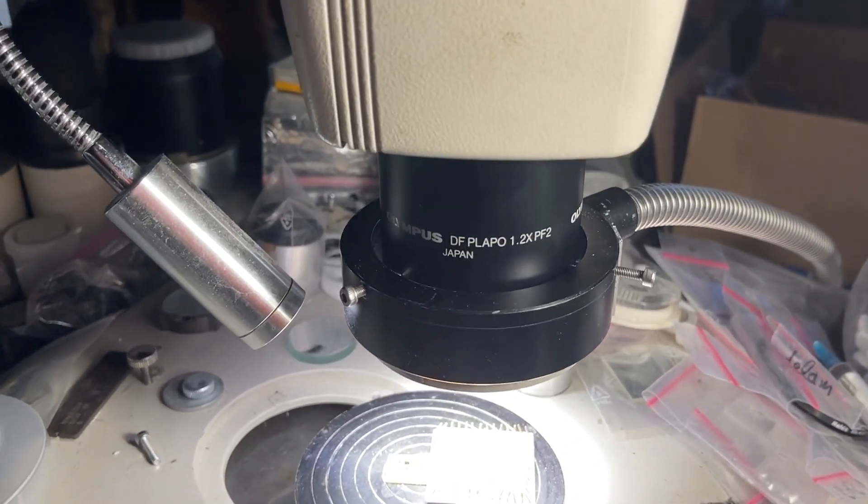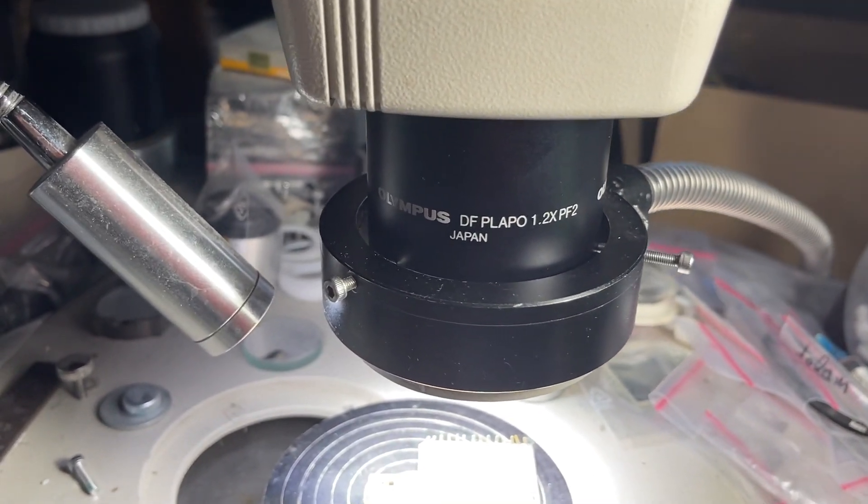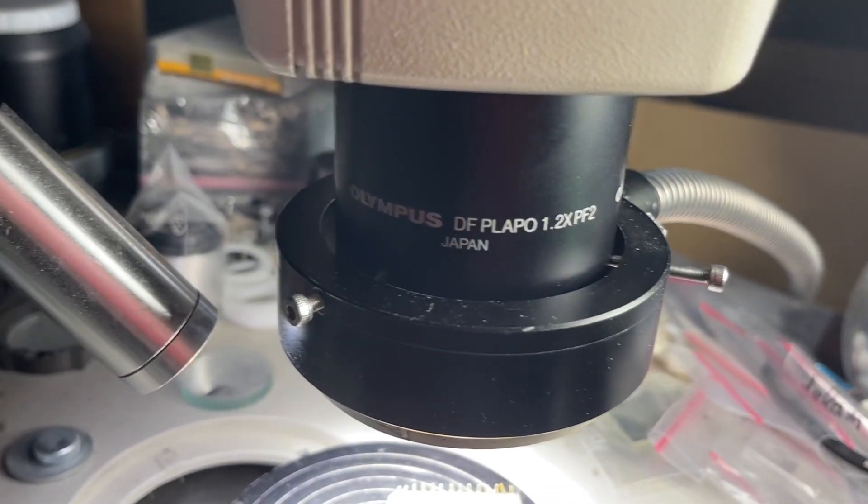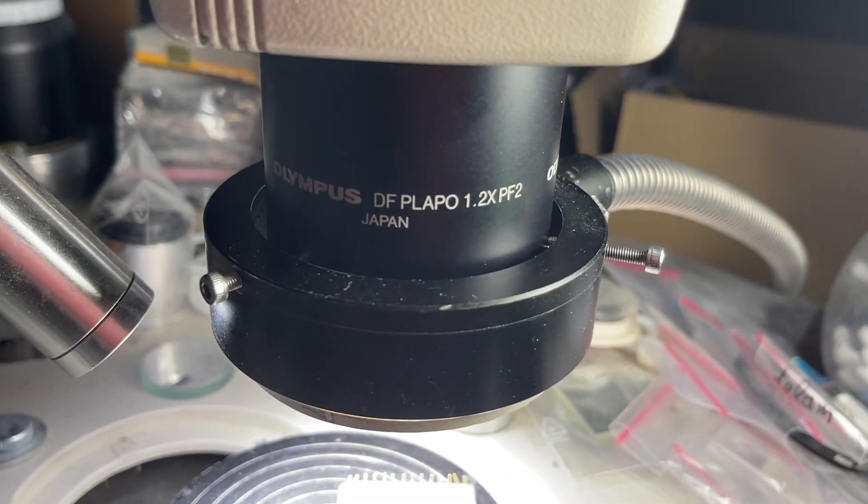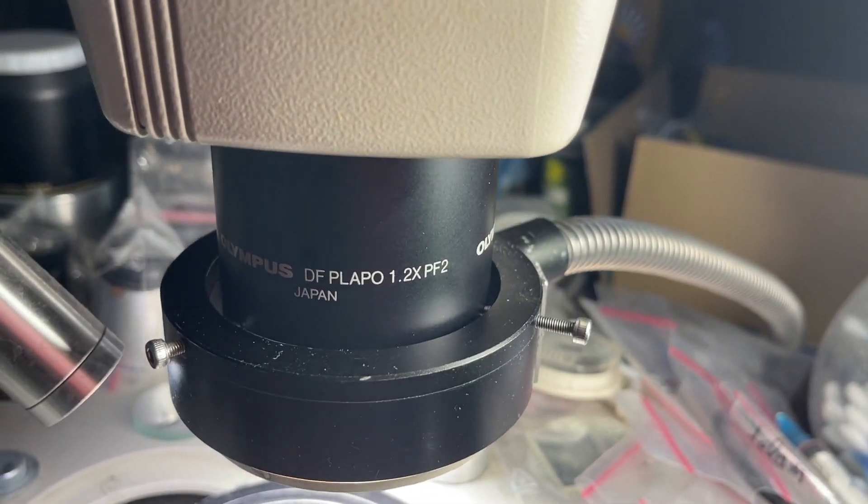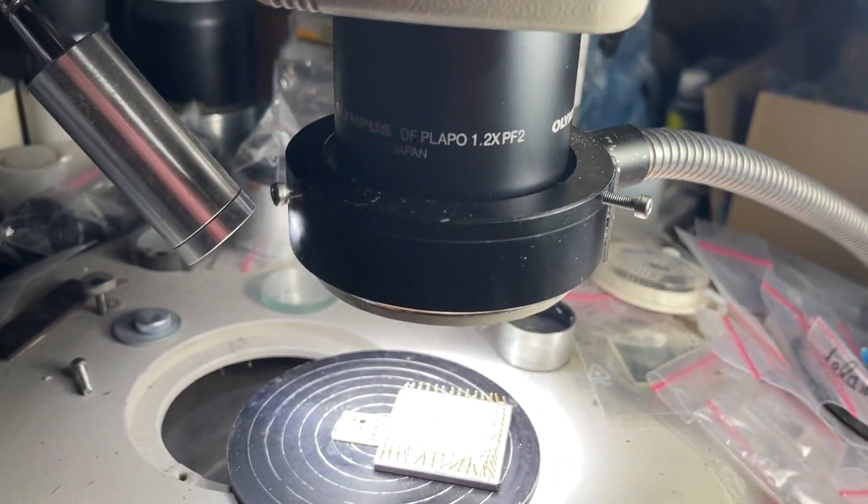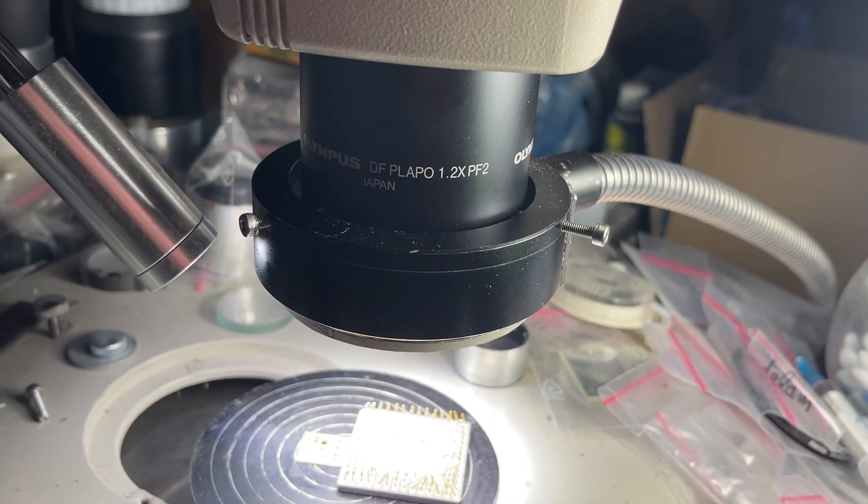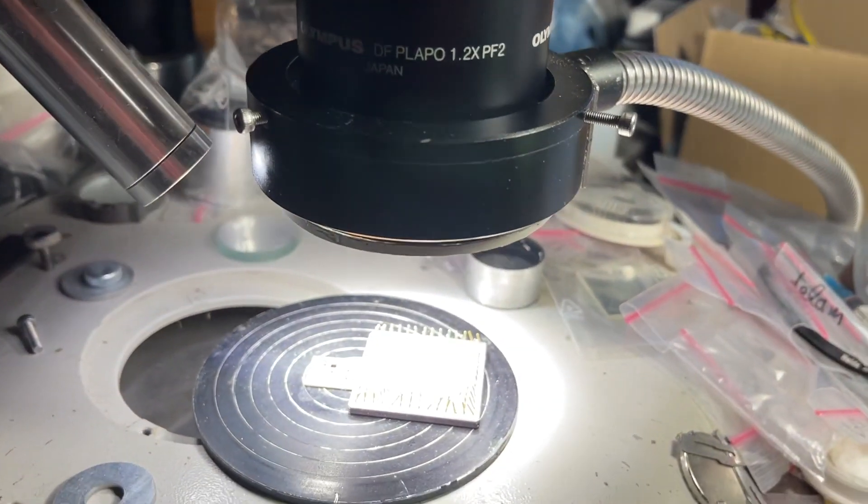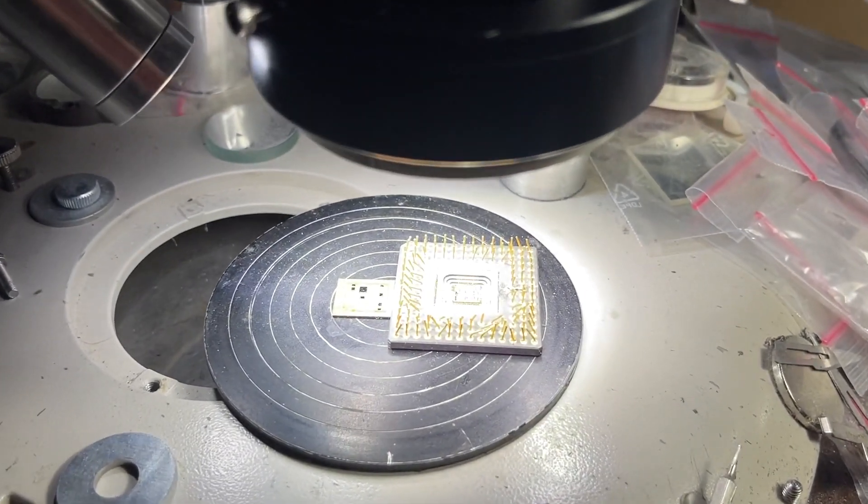Okay guys, here's another pretty famous objective for many of you because Maxim from Muromansk got it from me two and a half years ago. It's an Olympus objective with resolution 35% higher than the regular Nikon Ediplan 1x.